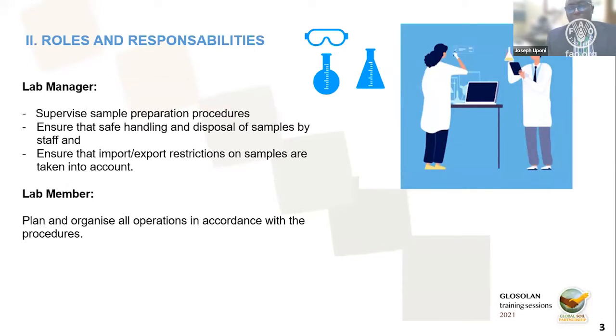Now, there are roles that need to be played by different participants in the lab. The lab manager takes overall supervision, and he has to make sure that the different SOPs for handling the soil samples are available, and the people who are handling those analyses are adequately qualified and trained to use them. They should have been tested to be sure they are able to do it reproducibly. So that aspect of supervision is the responsibility of the lab manager. He should also ensure that safe handling and disposal of samples by staff is done. This is because soil samples by nature carry different other things apart from the soil. They have pathogens and things like that.